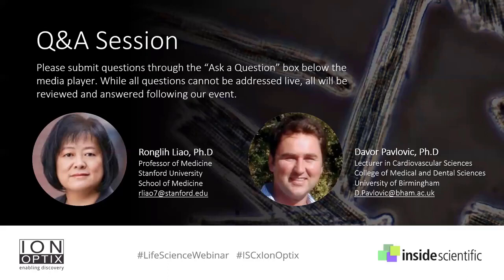And it is important to know garbage in, garbage out. So don't do the experiments unless you know, to the best of your judgment, you have a good viable cell. But also don't wait for a miracle to happen either. Again, I would reiterate, practice makes perfect, and you will learn from your own experience. And I think that's probably the best way.